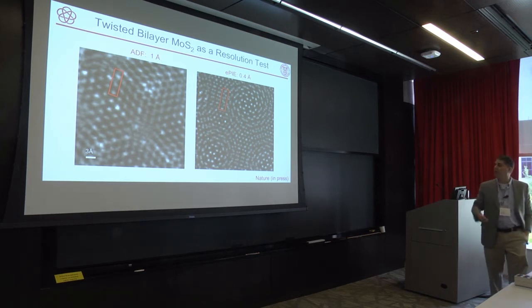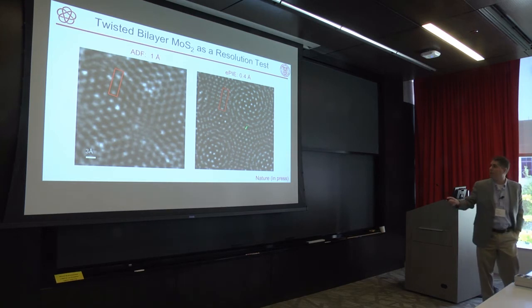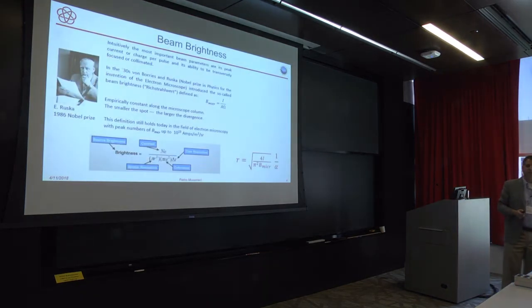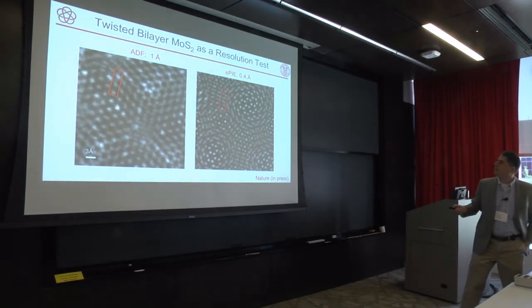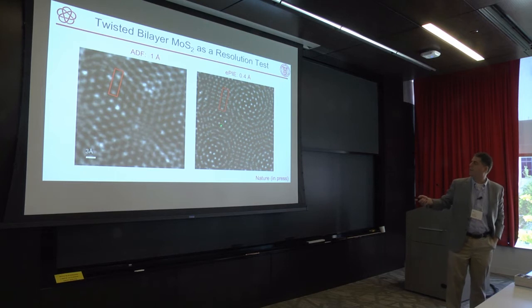And as other people adopt our detectors, I'm sure we'll get beaten. So that's the motivation for why we want to keep pushing on the resolution of microscopes, because there are still some atoms here we haven't resolved. So each dot representing what? Yeah, each light dot is a single atom. The very bright ones are two atoms because it's one on top of the other.